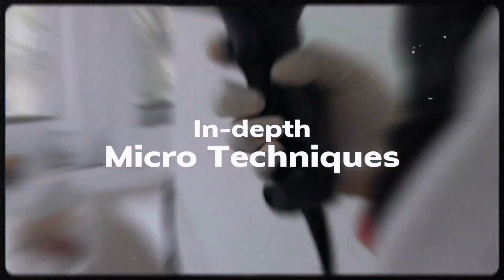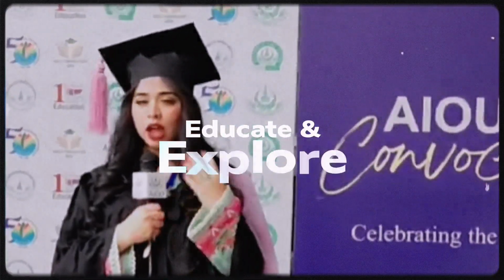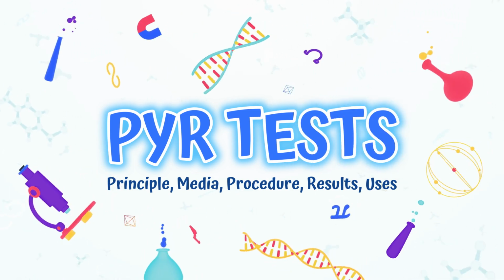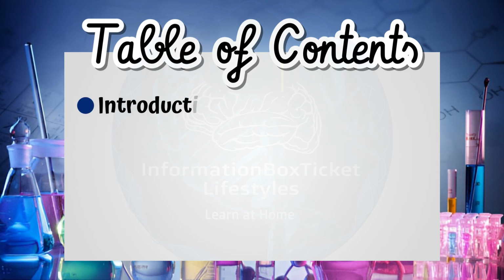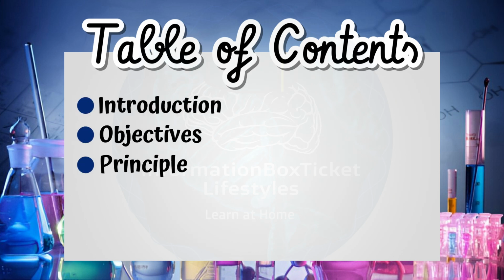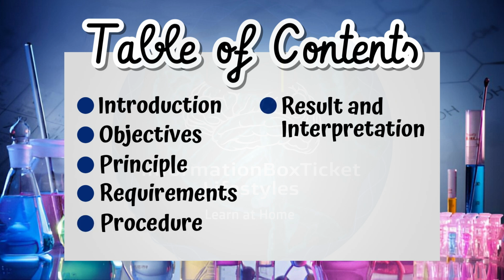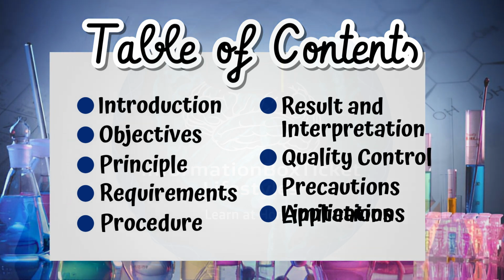Let's explore in-depth micro techniques and uncover groundbreaking insight together on this educational journey into the fascinating realms of microbes. PYR Test. Principle, Media, Procedure, Results, Uses. Table of contents is Introduction, Objectives, Principle of PYR Test, Requirements for PYR Test, Procedure of PYR Test, Result and Interpretation of PYR Test, Quality Control, Precautions, Applications of PYR Test, Limitations of PYR Test.